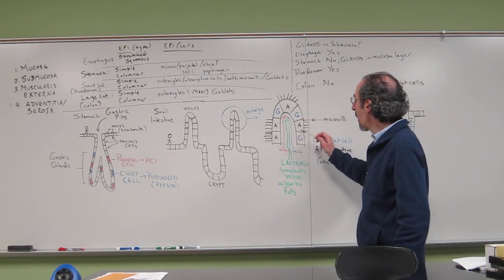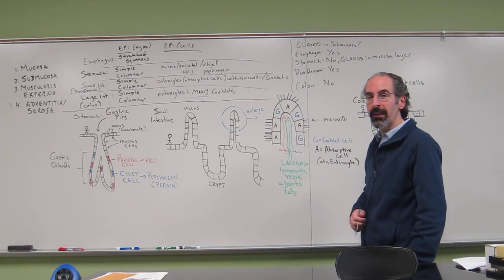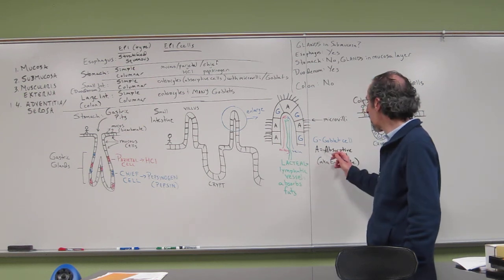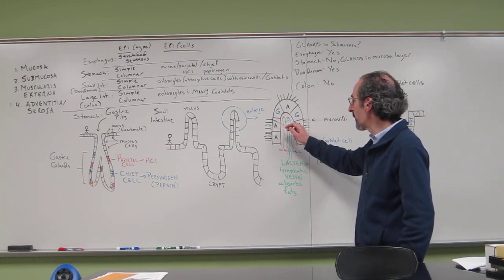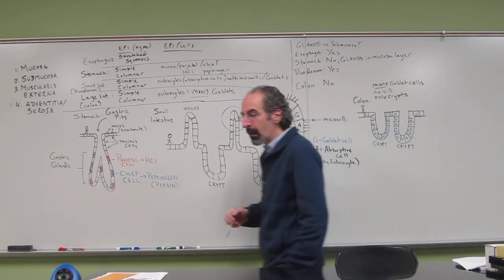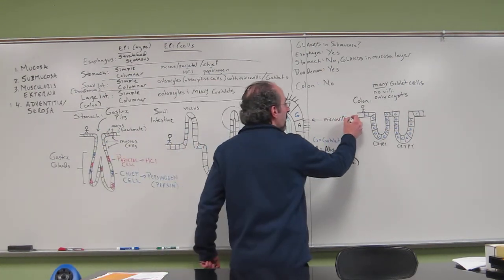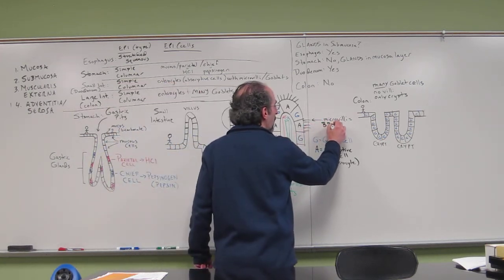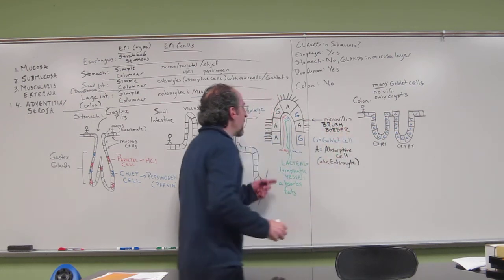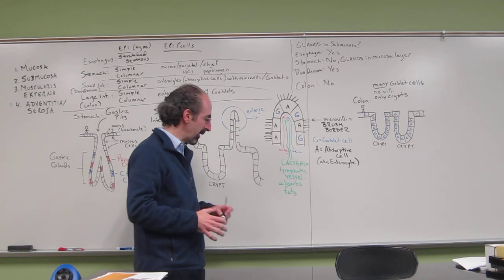In addition, the other predominant cell type that we see here are cells that are called absorptive cells. Your textbook or some other textbooks may call them enterocytes. They go by a couple of different names. What's notable about them is that they contain microvilli on their surfaces. The microvilli contain enzymes that also help you absorb food. The microvilli are sometimes known as a brush border, because the microvilli make the apical ends of the cell look a little fuzzy in their appearance.